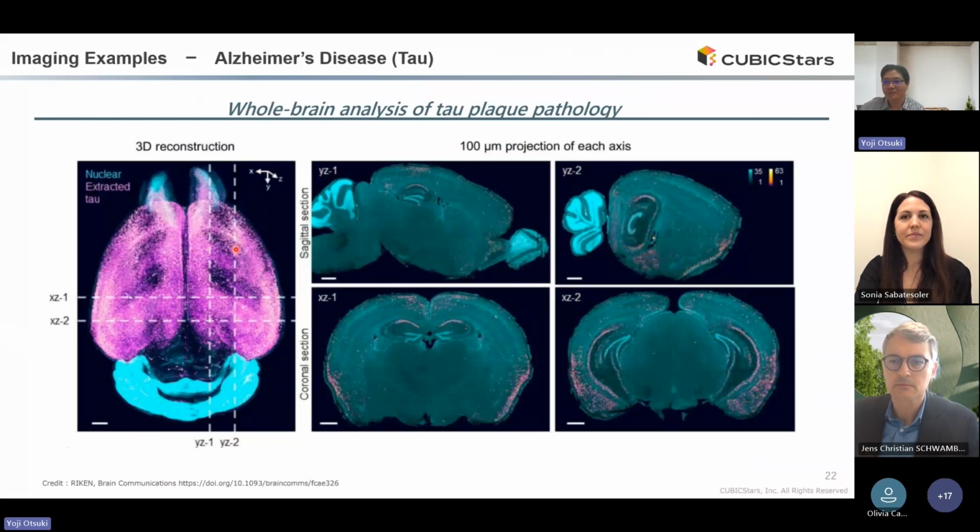Yeah, at least for the research project-based experiments, we tried the staining for anti-synuclein, which is more related to the Parkinson model. Our techniques also successfully stain the whole brain distribution of the alpha-synuclein deposit. So yes, it can also be applied to Parkinson studies as well. Thank you.